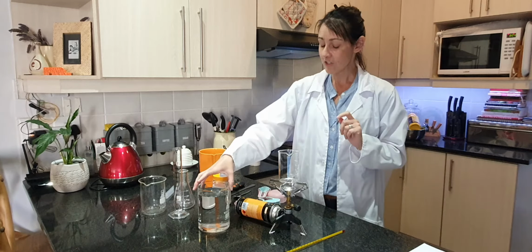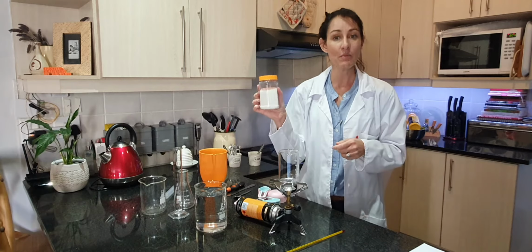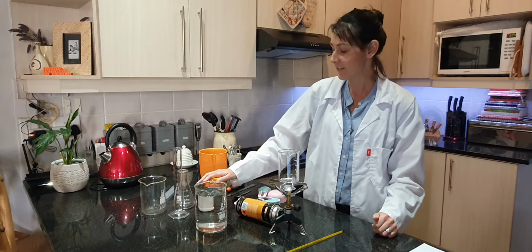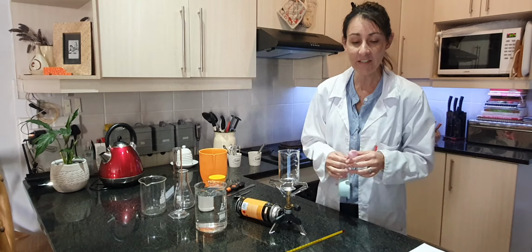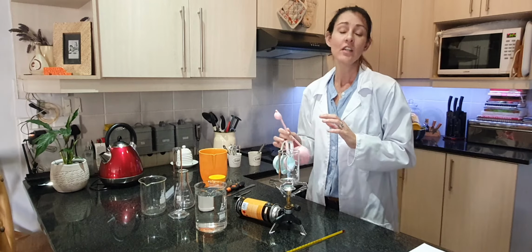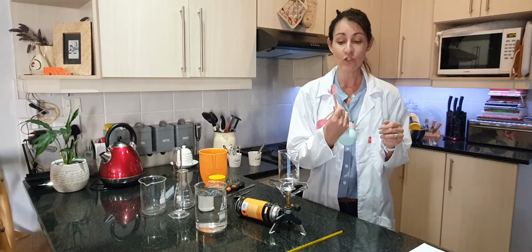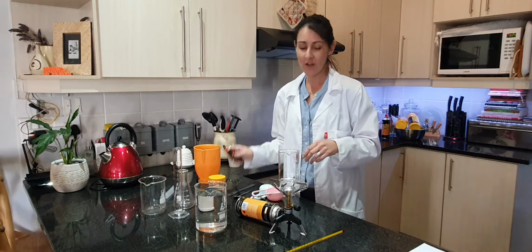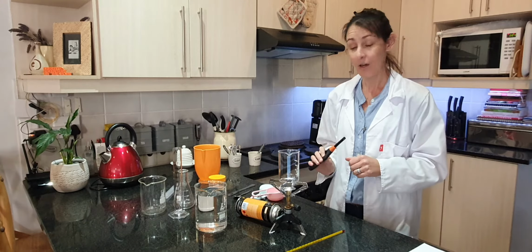Then we need our water. I've got a beaker that already has some water in it. And we need some table salt. The chemical name for table salt is sodium chloride. I also have measuring spoons, because in your practical it says that you need to use teaspoons of salt. Every time we do it, you're going to need another amount of table salt, and I'm going to use these so that we have accurate measures. Then I also have my little lighter over here so that I can switch on our gas.